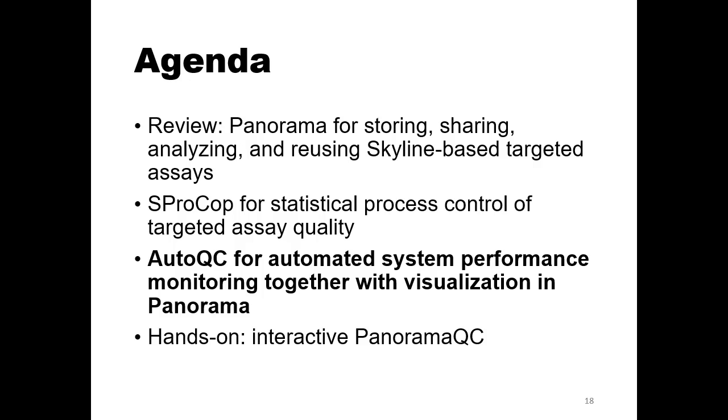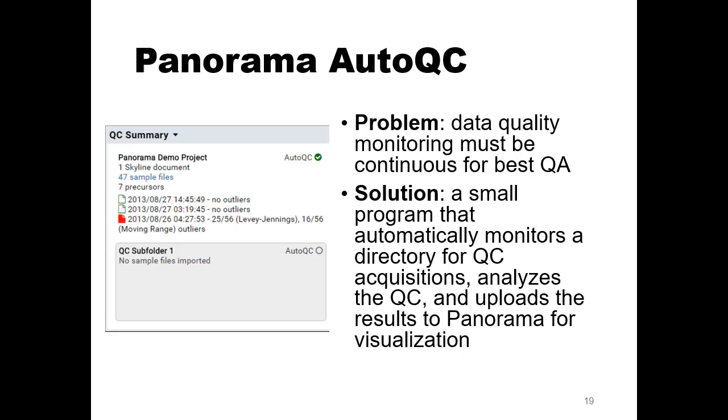So now we come to AutoQC. Changing gears again, AutoQC came from Vigisha noticing this problem where it was kind of monotonous, kind of tedious to monitor these types of runs on your mass spectrometer. You relied on people in your lab being good lab mates and running their system suitability samples, and it relied on you being a good researcher and running those and analyzing all of that data.